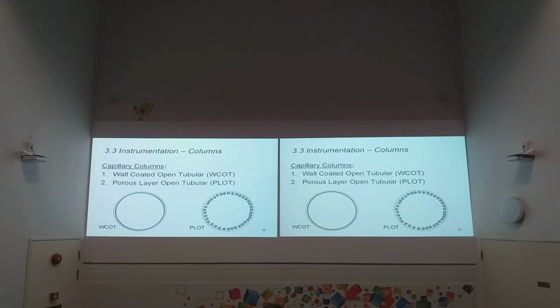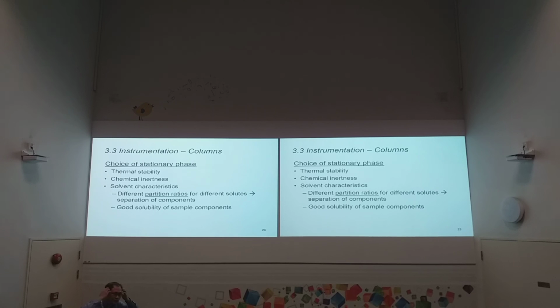That will result in a very direct effect. With high surface area, the interaction becomes more, right? So it will directly impact and affect the separation efficiency. Okay? But this one, you don't need to remember, you just need to try to understand. And these few slides I leave with you. You don't need to remember the acronym, whether it's WCOT, whatever, but more importantly is to understand the separation principle.